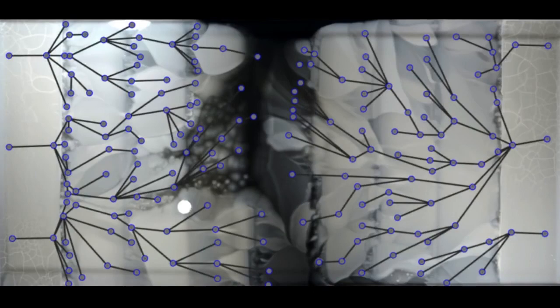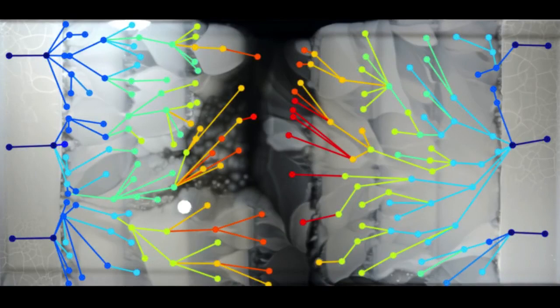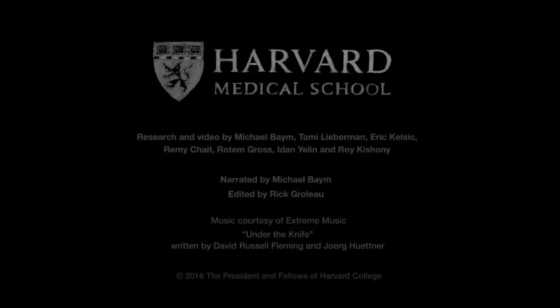And after about 11 days, they finally make it into 1,000 times as much antibiotic as the wild type can survive. Cloudy white splotches begin to reach into the innermost band. And so we can see by this process of accumulating successive mutations that bacteria, which are normally sensitive to an antibiotic, can evolve resistance to extremely high concentrations in a short period of time.